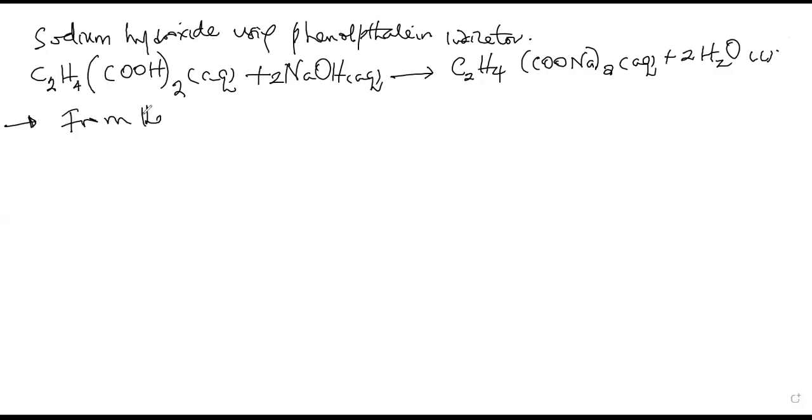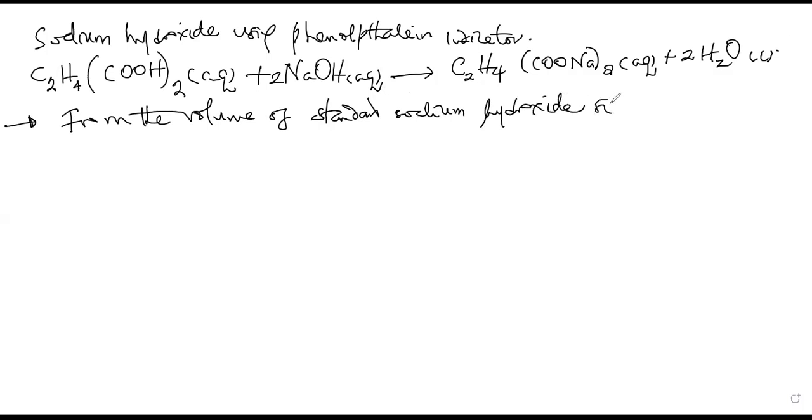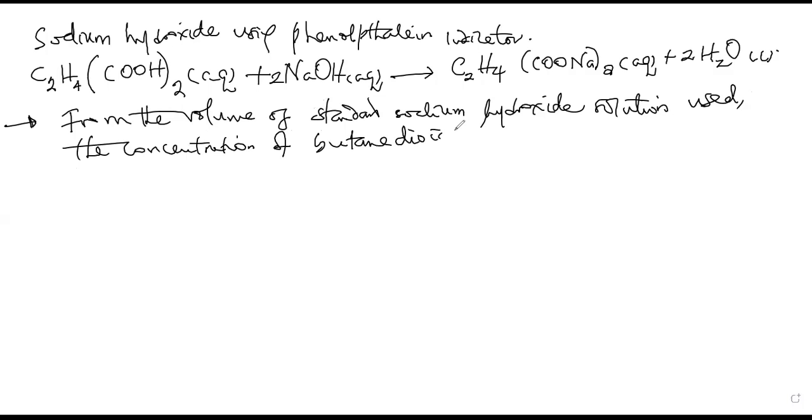From the volume of standard sodium hydroxide solution used, the concentration of butane dioic acid in aqueous layer is determined.